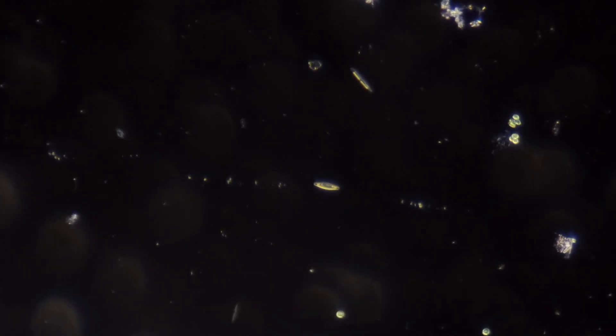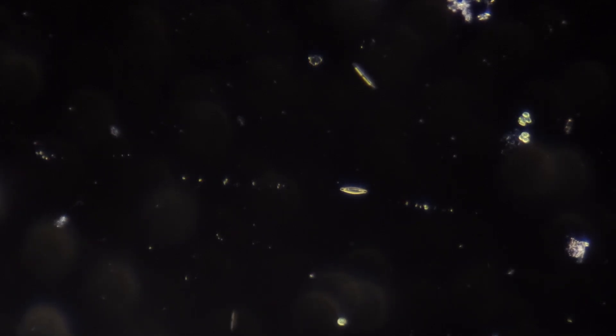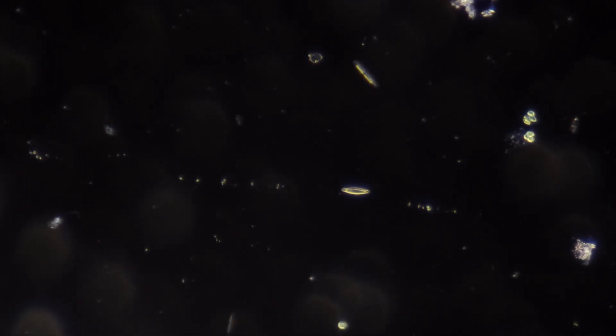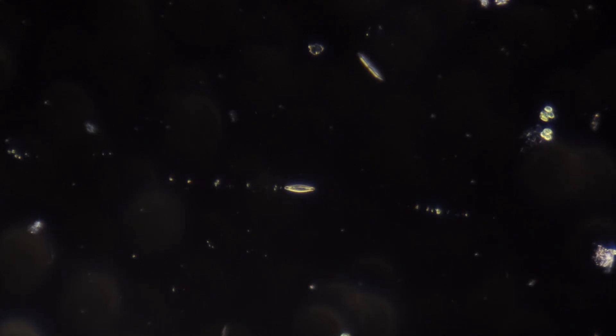Unlike microscopic animals and the more animal-like unicellular organisms, it doesn't have cilia or flagella. And looking at it, one could almost assume that it was able to magically glide through this dark field, as if by levitation. Its mobility makes it not unique, but special.